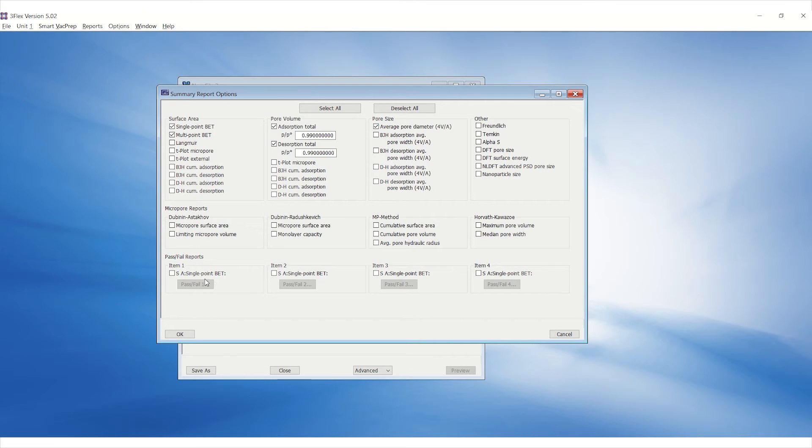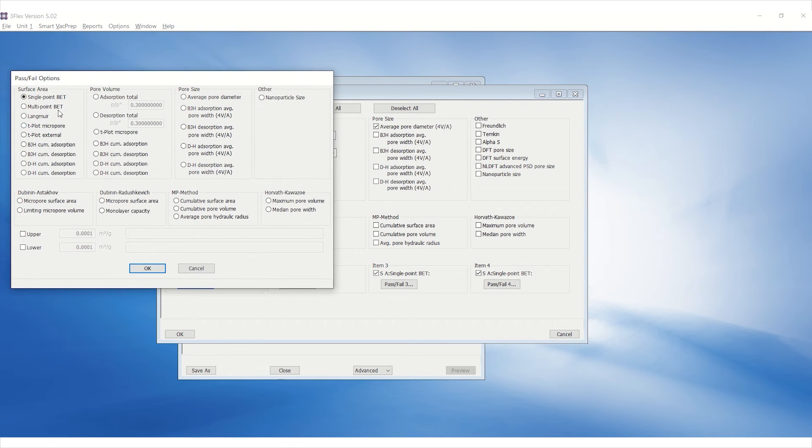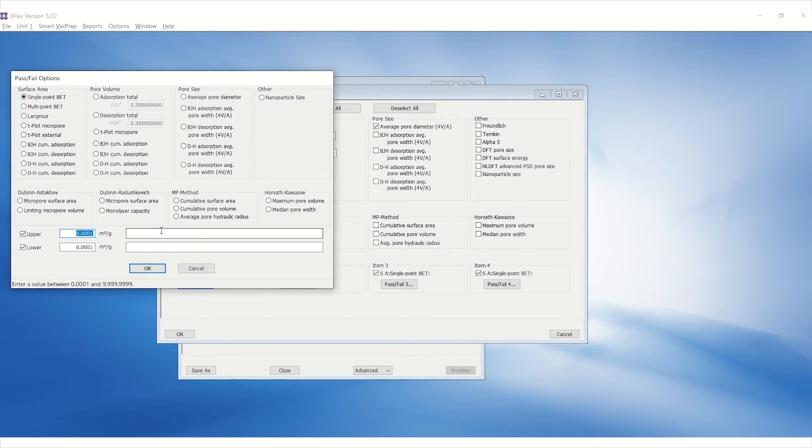Check all four Pass-Fail Reports and click on Pass-Fail 1. Select Single Point BET under Surface Area and enter the upper and lower specifications. Ensure to enter the lot number for future reference.